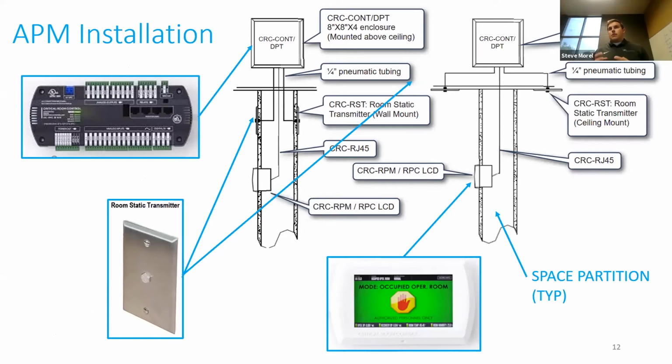One way, and the original way a lot of people did, was mounting everything right in the wall. Doing your electronics, running your power to the wall, running the pneumatic tubing, having your transducer right there in the wall. There is a benefit to that. It's easy to access because it's right there on the wall, and I can access any improper wiring or other issues that could be a problem with the transducer or the pressure monitor.